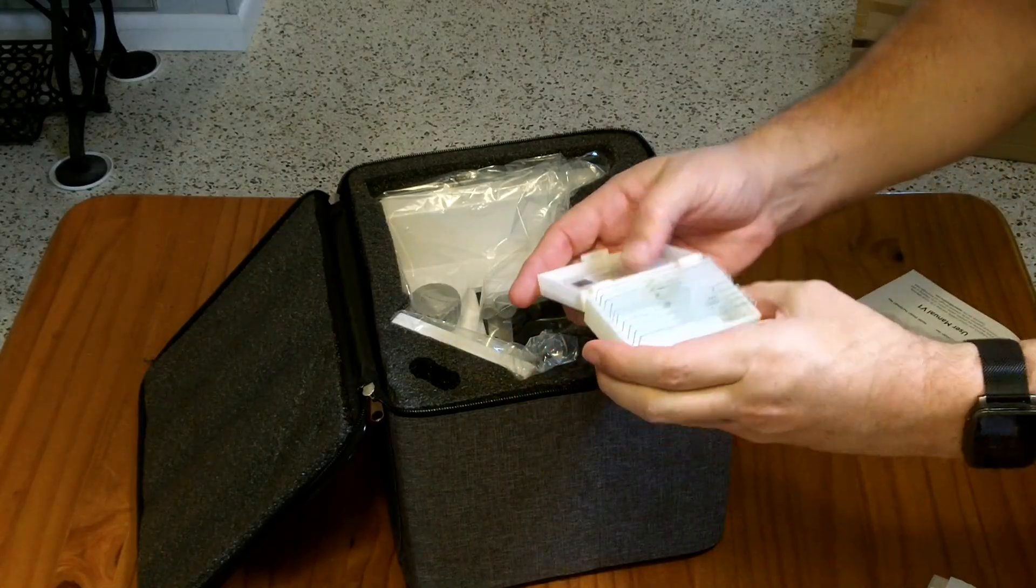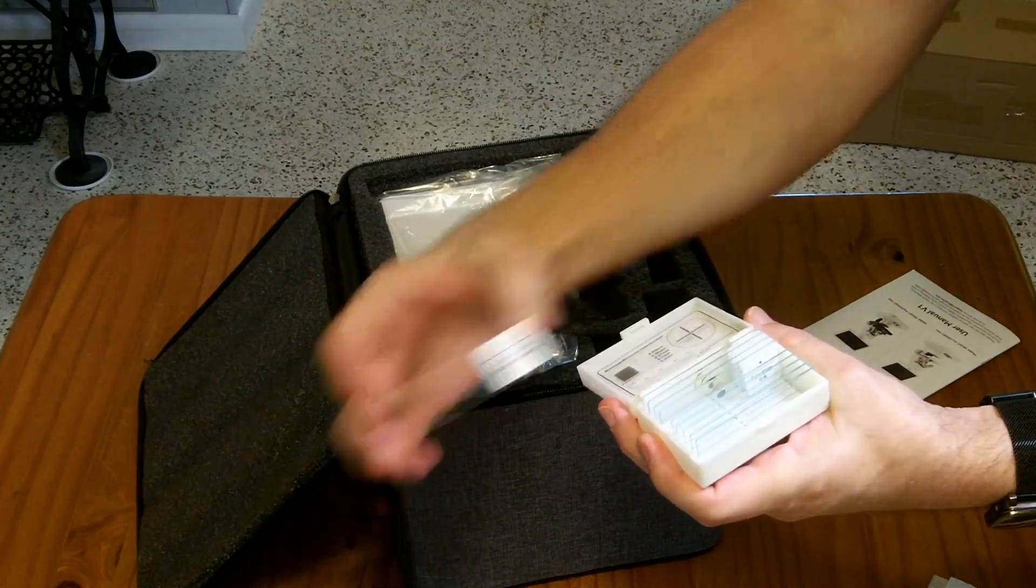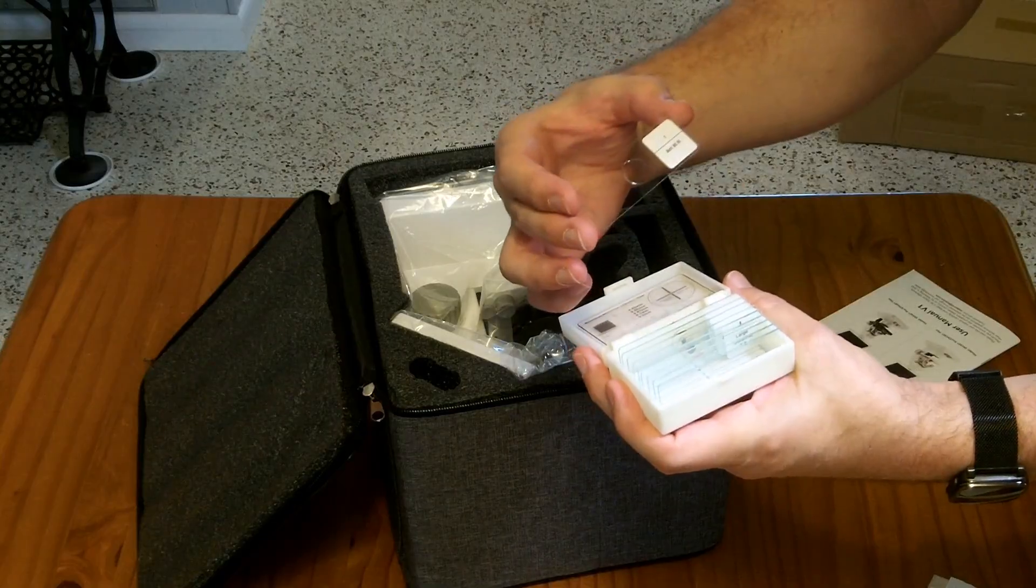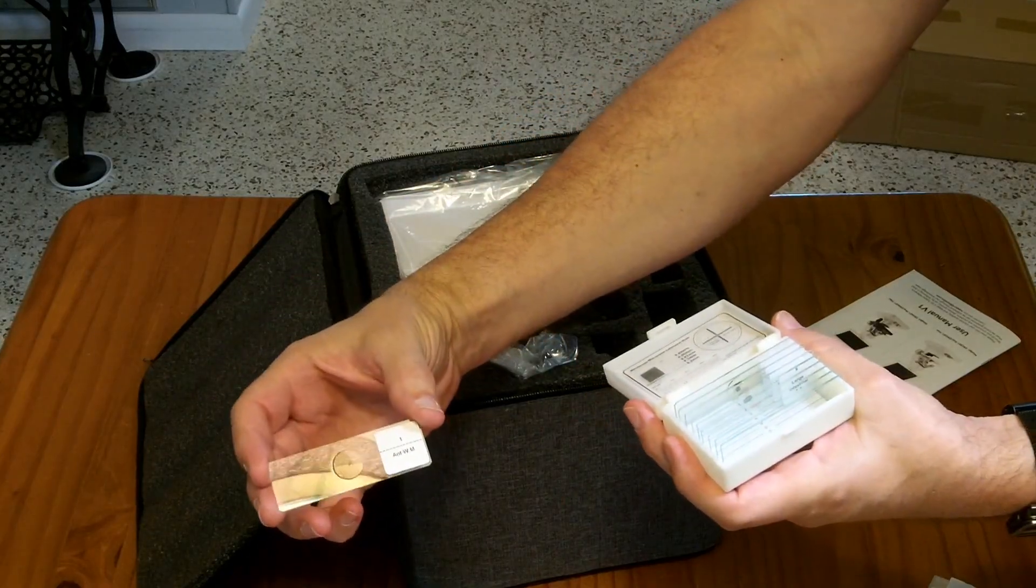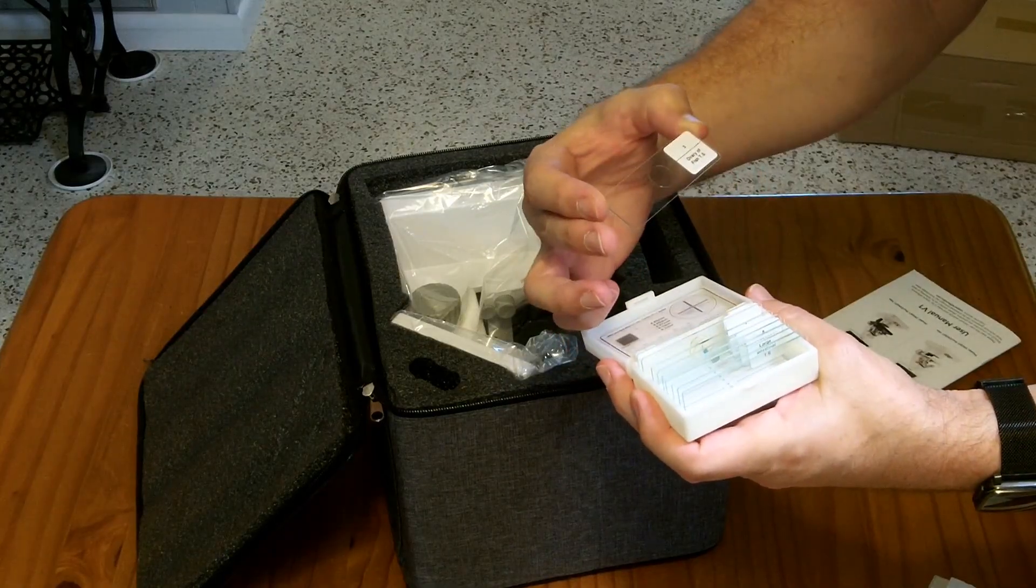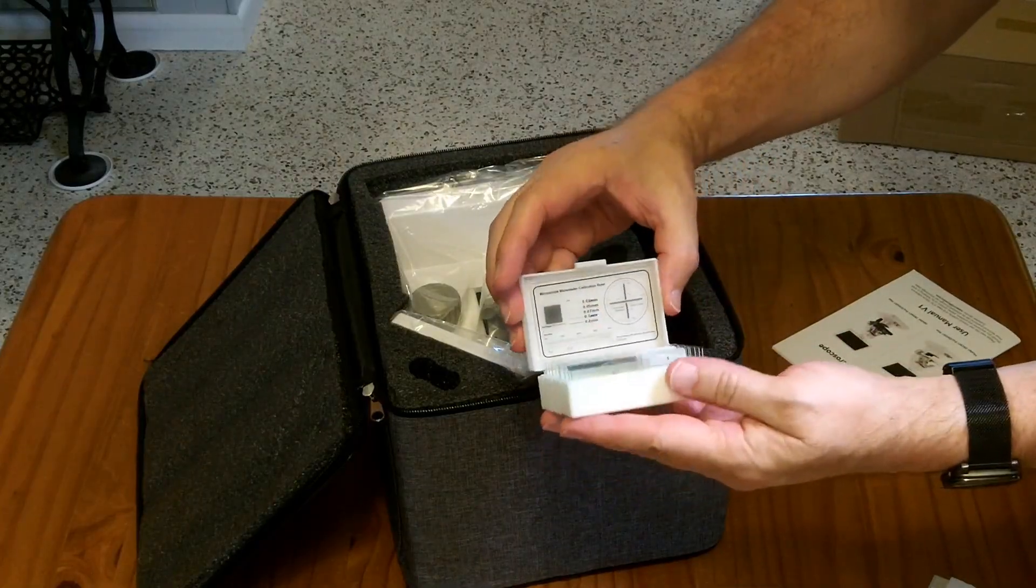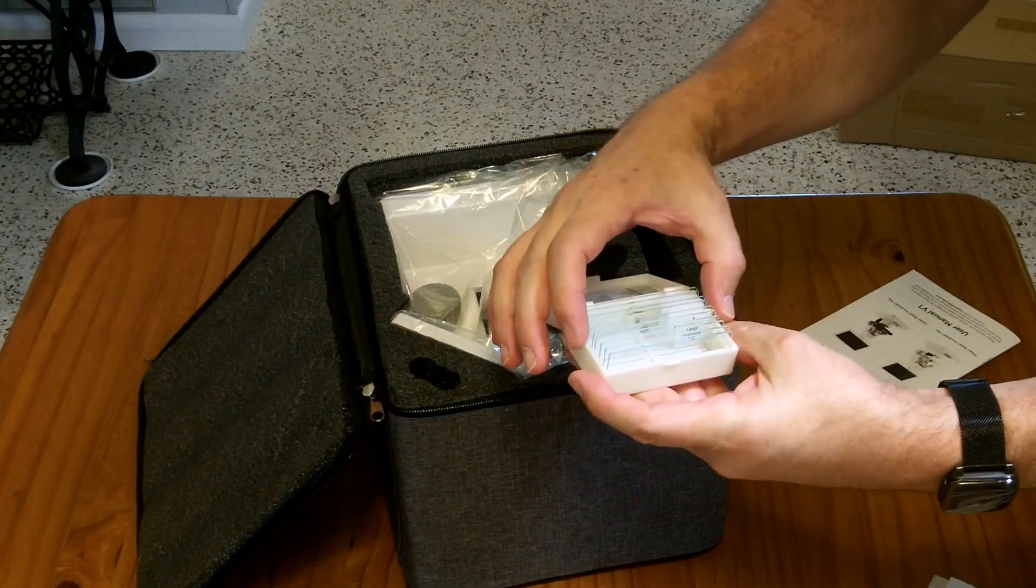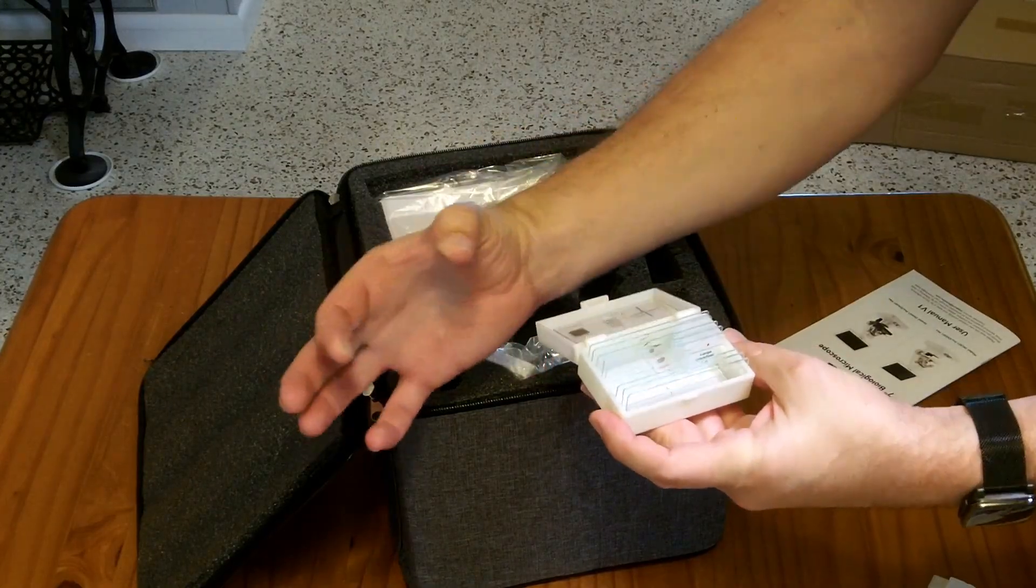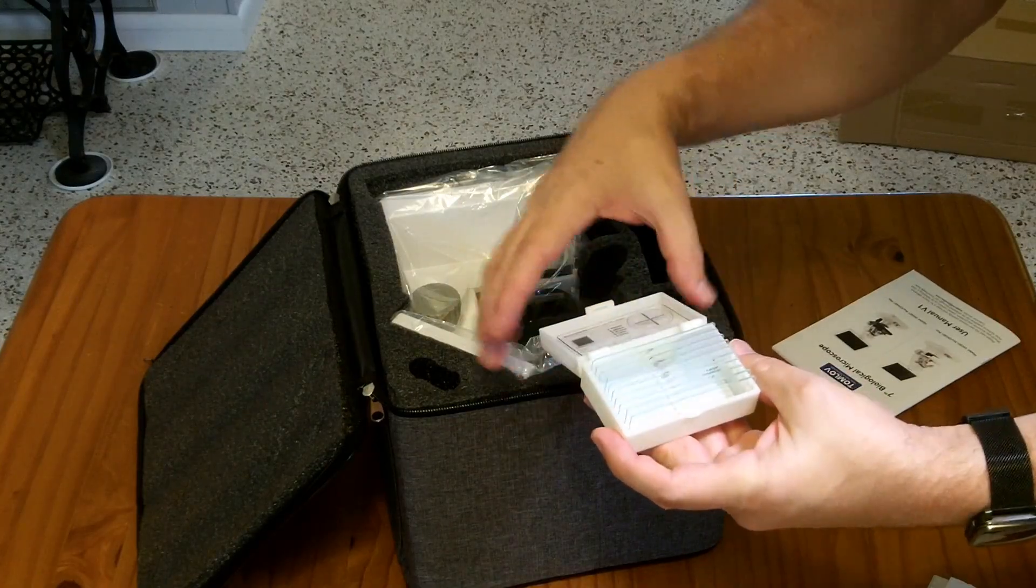They have these numbered, this says large intestinal, this says ant WM, ovary of a fish. So they have various biological specimens pre-built on these slides. It looks like they have 5 specimens pre-done and they give you 5 glass slides that don't have anything on them for you to put your own specimens on.